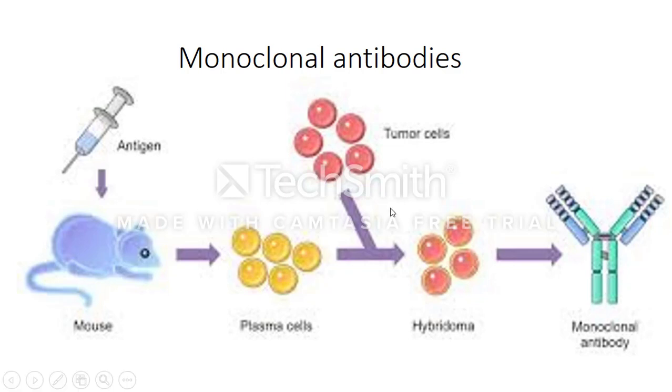Now there's also another method called dual label fluorescent microscopy, and we can use these antibodies for many proteins and overlap pictures to see where proteins are relative to each other. And this can only be done with dead cells. So we're basically going through this process twice, or multiple times. We allow these primary antibodies to bind, allow the fluorochromes to bind with another antibody, and we do that for one set of proteins and then another set of proteins, and then we can Photoshop what we see in the microscopic images on top of each other and see where these proteins are respective to each other.